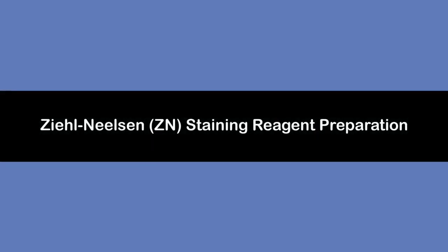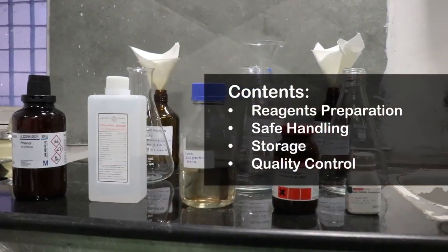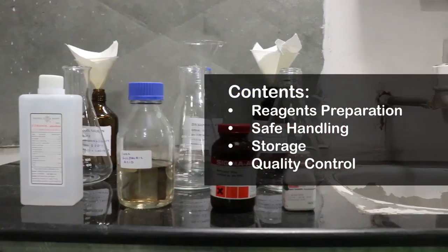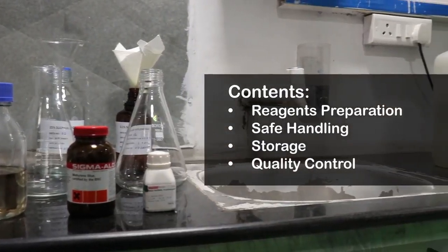In this training video, we will observe Ziehl-Neelsen staining reagent preparation. The video content includes reagent preparation, safe handling, storage, and quality control.